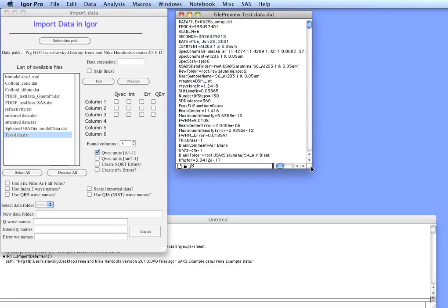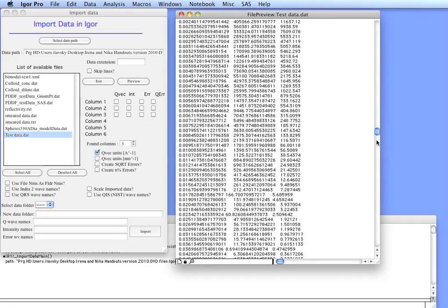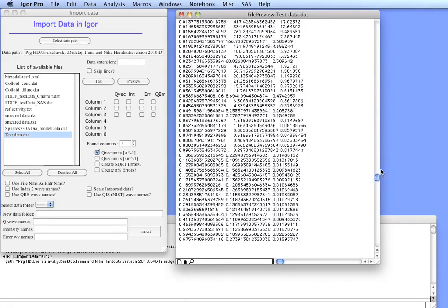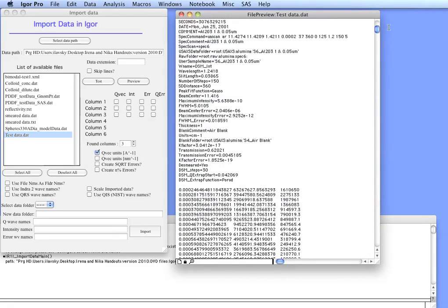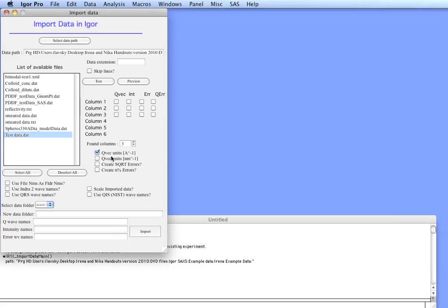In this case there's a header and then you can see column one, column two, and column three which contains the data. The first column is Q, second is intensity, and third is error.